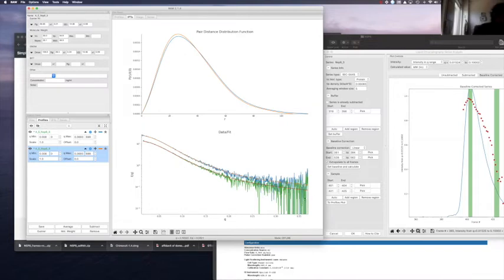But generally speaking, what was recommended is using this deconvolution, and let's try it. I know it's not going to work for this case because of this transient behavior where monomer and dimer are appearing across the whole elution. So there is not a perfect separation between this monomer and dimer. It's really just a little bit. You can see almost similar P(r) functions and almost similar radius of gyration, and only a slight difference in molecular weight.